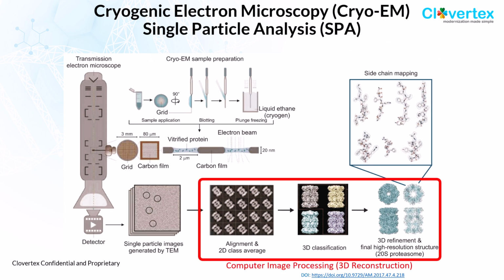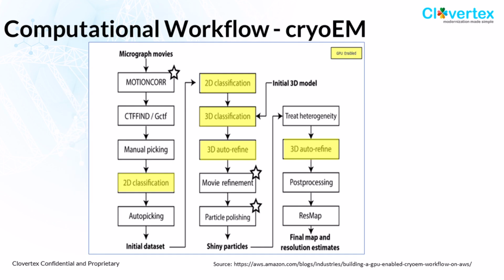So my research focus is the computer image processing part of single particle analysis. It is heavily based on statistics, math, image processing, and 3D reconstruction algorithms. For example, this is a typical computational workflow used in cryo-EM single particle analysis.